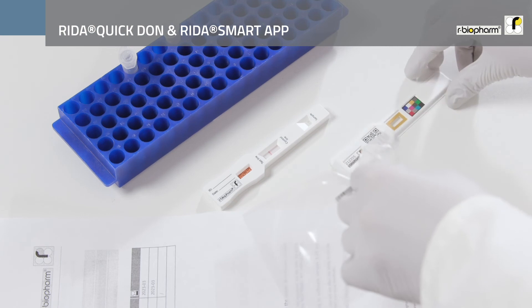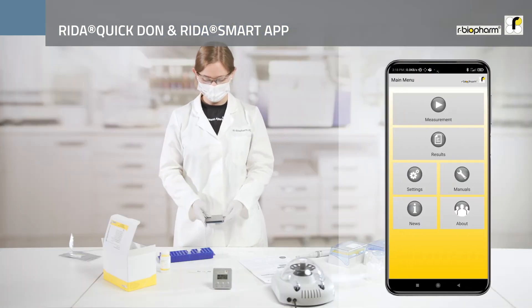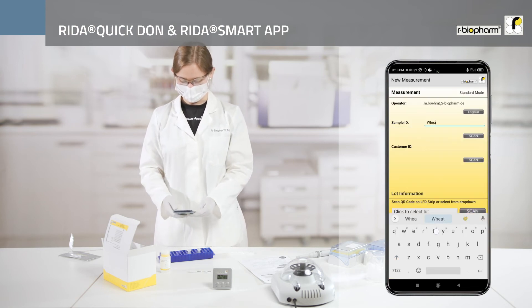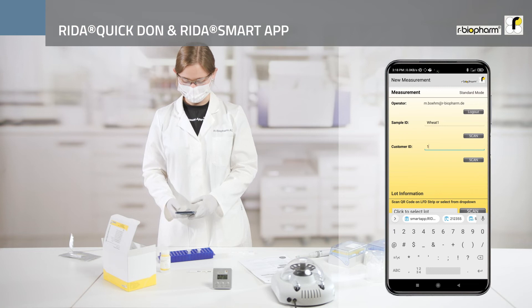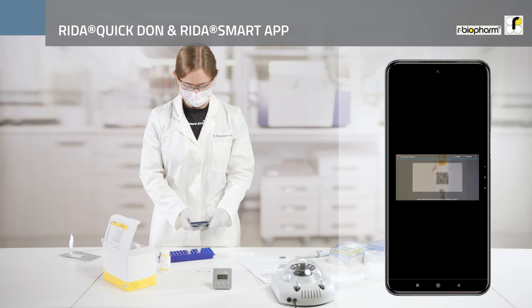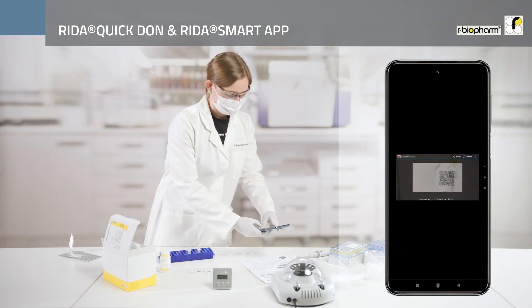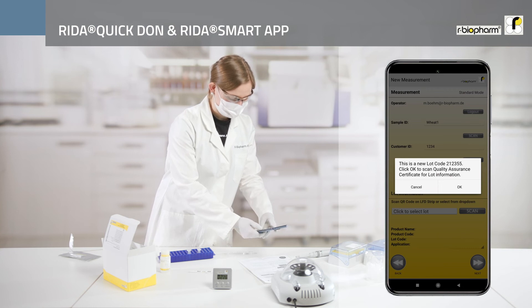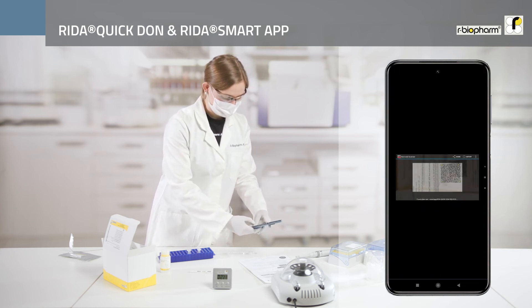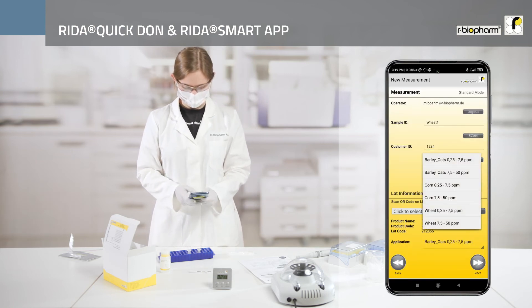During the incubation time you can quickly set your sample information: press measurement and enter the sample ID and, if necessary, the customer ID via the keyboard or a barcode scanner. To scan the method you must first scan the QR code on the cover, followed by the QR code on the certificate. Now you can select the appropriate application.